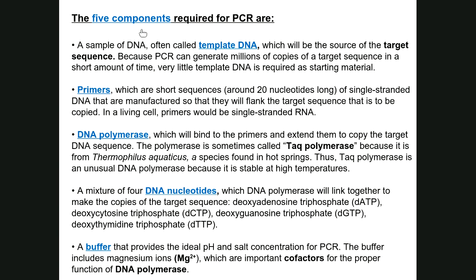what we normally do is we give you these small little test tubes called Eppendorf tubes or PCR tubes. And to these PCR tubes, you add 5 components. The 5 components are your template DNA. Listen carefully. In today's lab, you have 3 different template DNAs. You do not put all 3 of these template DNAs into the same tube. So at a minimum, you will have to set up 3 PCR test tubes. Each tube will be containing one of those 3 template DNAs.